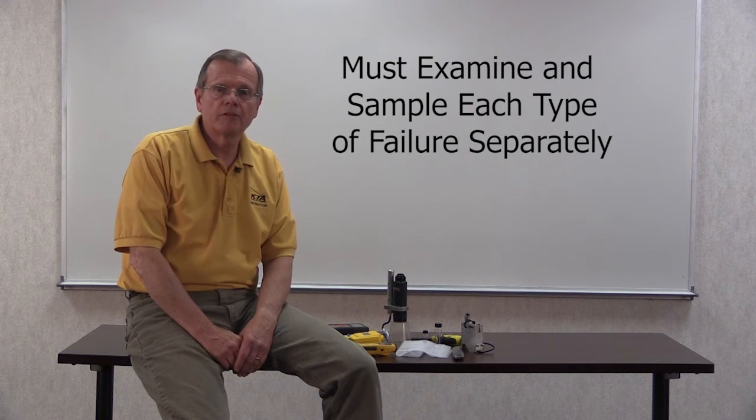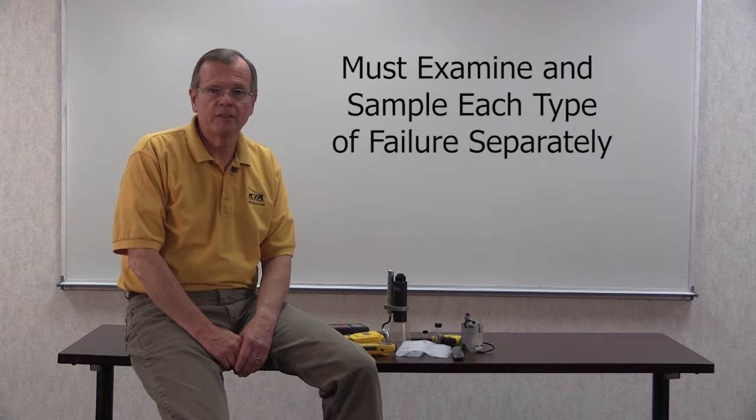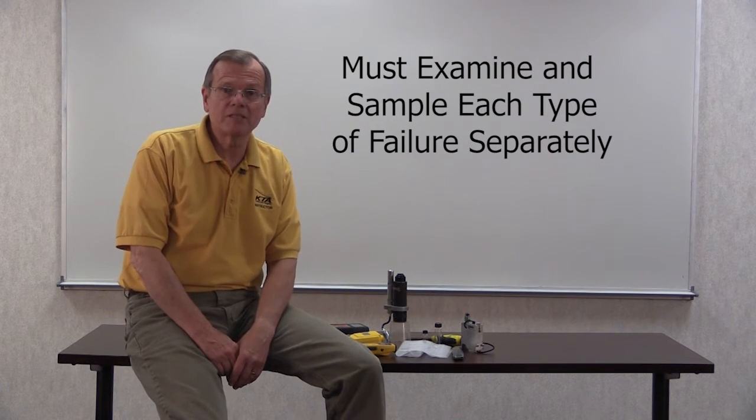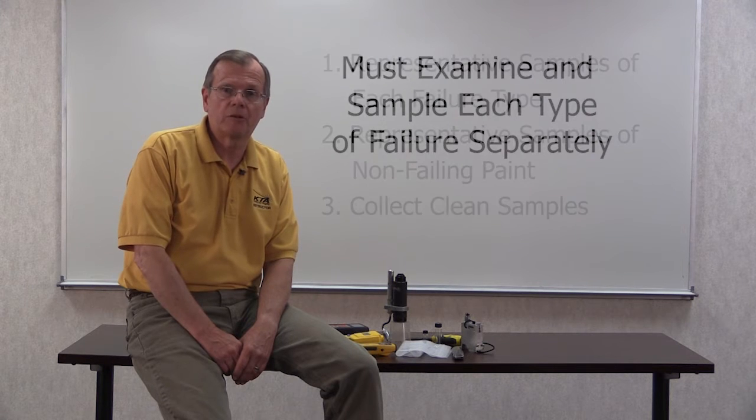For example, the failure of a coating system to the substrate must be treated differently than a failure between coats. In the end, the cause may be the same, but when conducting field analysis and sampling, they must be treated as if they are two separate problems.